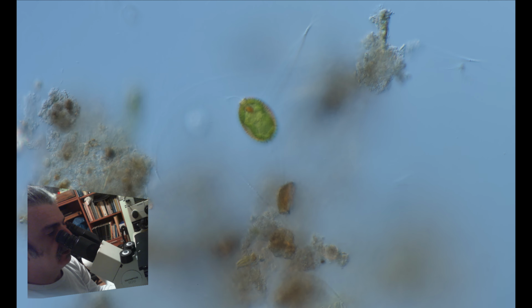Trachelomonas is a very nice algae that is covered in a protective lorica or shell. I'll add some more magnification and adjust the objective, and we can see that it has a red spot, its eye, inside.